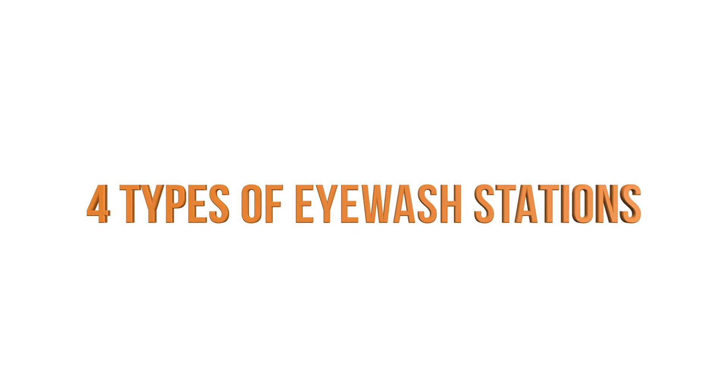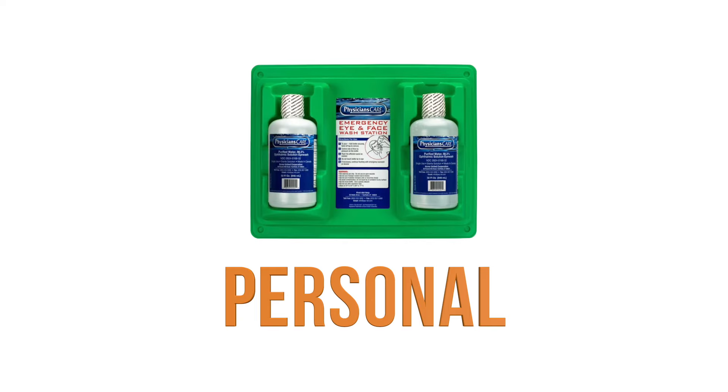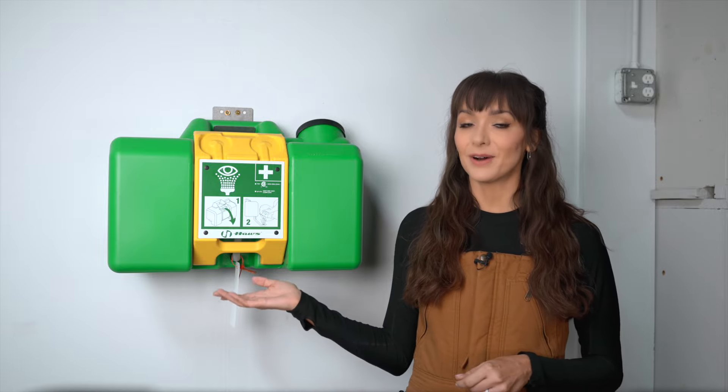There are four major types of eyewash stations: plumbed eyewash stations, self-contained eyewash stations, personal eyewash units, and drench hose eyewash stations. This video will focus on self-contained eyewash stations.